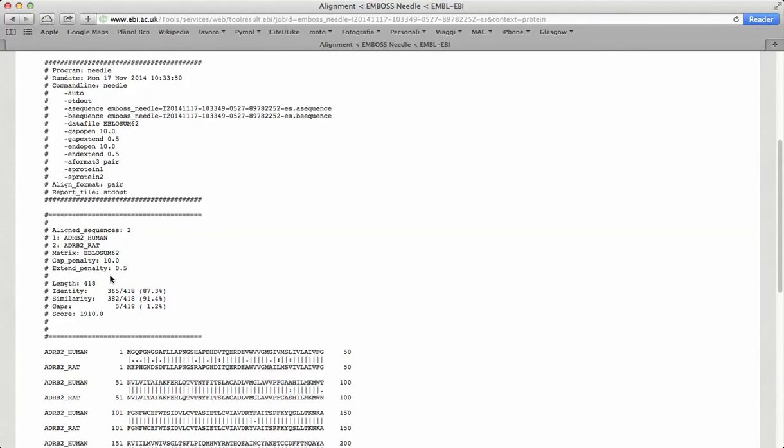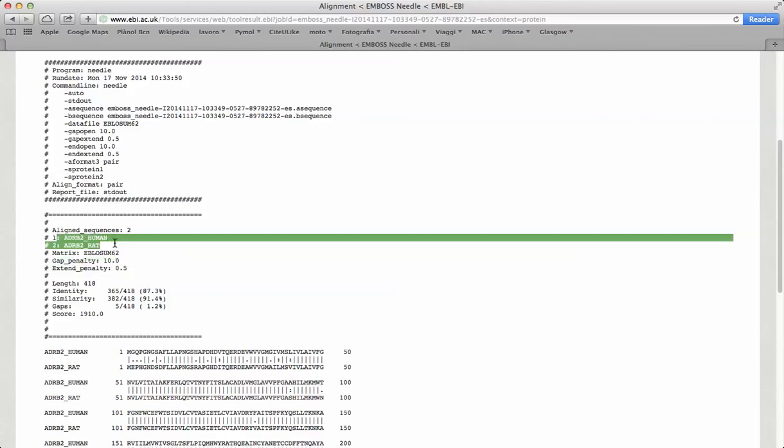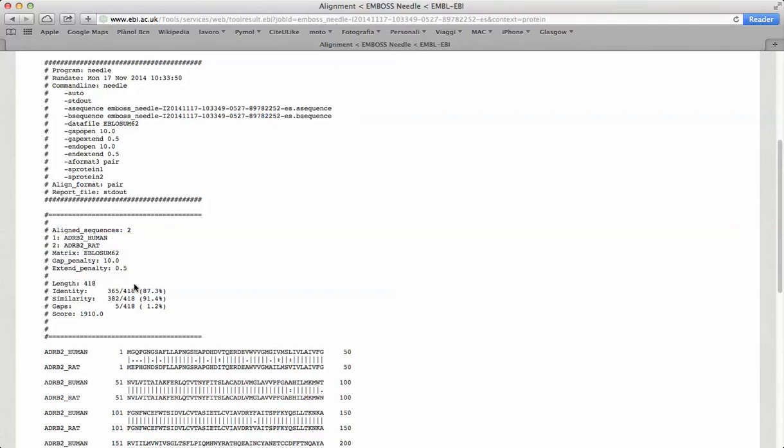The second part is about the alignment. It contains options used as alignment parameters, the sequences used as input, and the most important part, it contains the result summary.